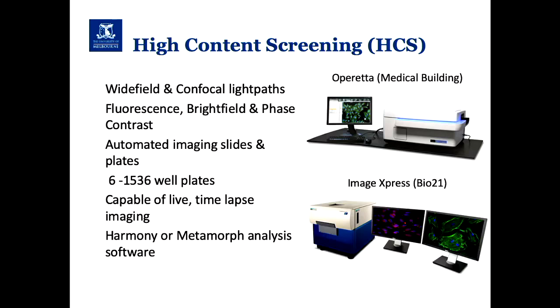The system is capable of live cell and time-lapse imaging, so we have it attached to CO2, and we can do temperature control as well. So we have people running experiments for 5 days quite happily on this system, waiting for a rare event to occur. And one of the real powers of this system isn't just the automation, but it's also the downstream analysis as well. So we can also tell the system, go and count nuclei and plot it out to me in an Excel spreadsheet.